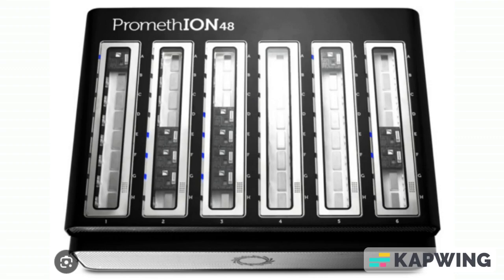at 500 bp per second, which is sufficiently powerful to achieve the ultra-high throughput needed for sequencing large genomes such as the human genome. Although the PromethION is not commercially available, ONT announces that it is capable of producing 2 to 4 TB over a duration of 2 days and a length of reads which can attain 200 kbp, which puts this sequencer in competition with the PacBio sequencer from Pacific Biosciences in terms of read length and the HiSeq sequencer from Illumina in cost.